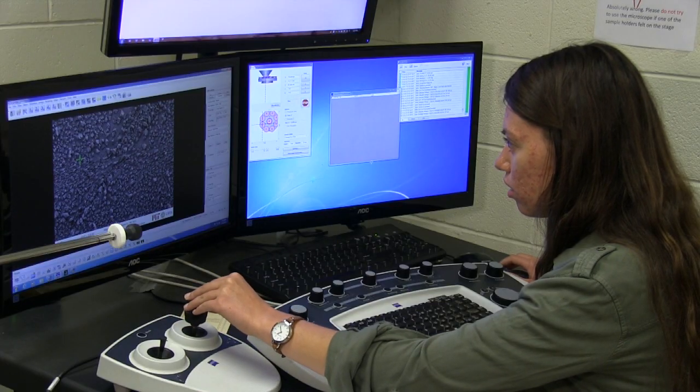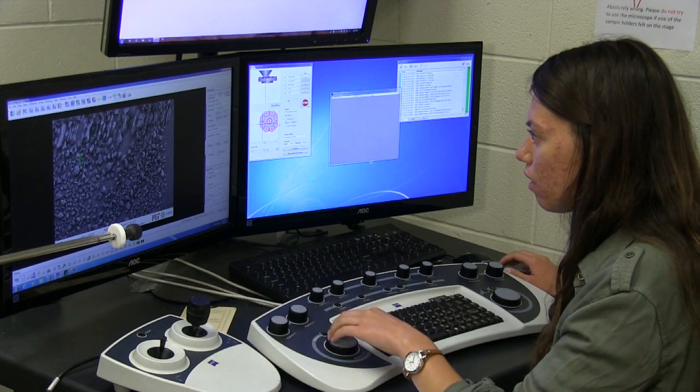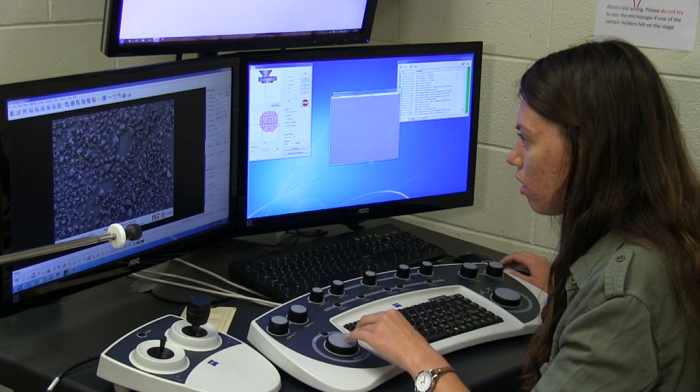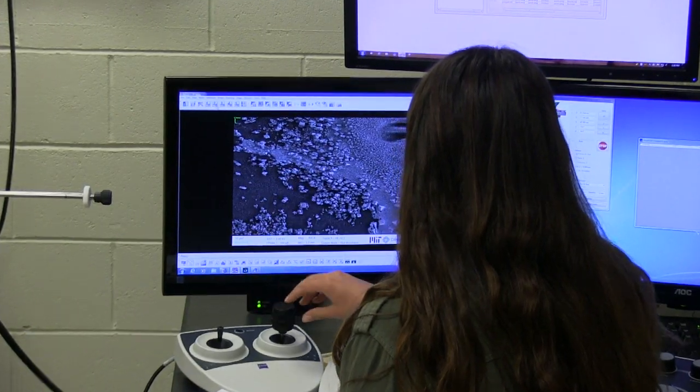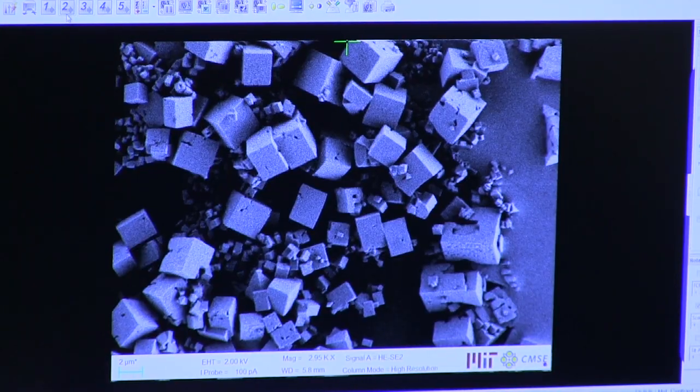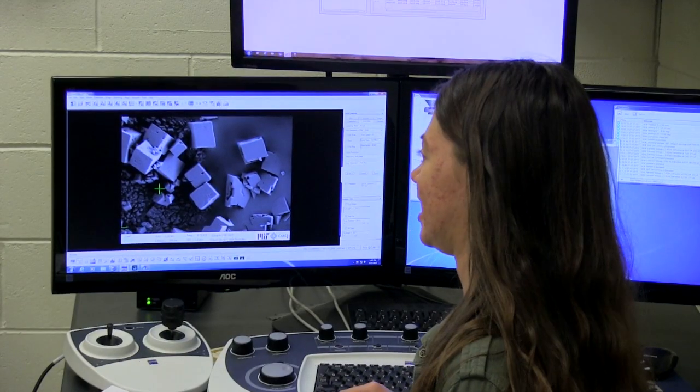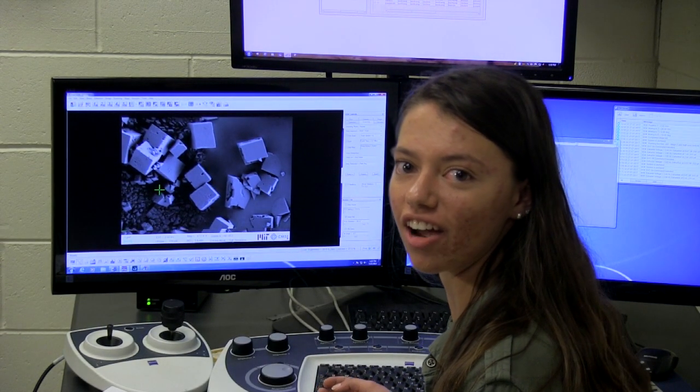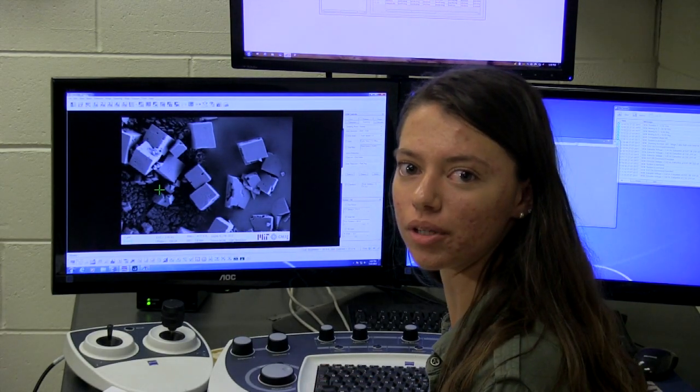Right now, I am analyzing some SEM images of the microplates. These ones are formamidinium lead-bromide perovskites. And basically, they form these little plates that are about one to three microns in one dimension. So, I'm looking at the microplates to see the different sizes that they are and looking to see if there are any defects or impurities.